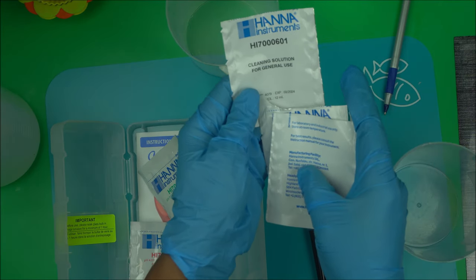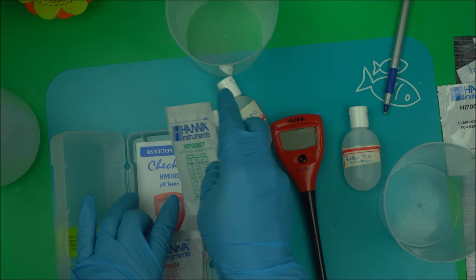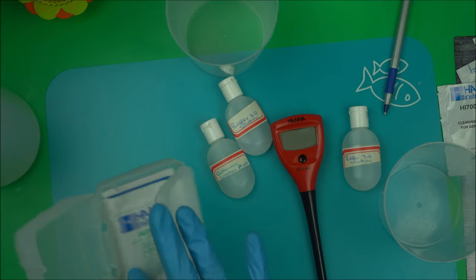You also get the general cleaning solution. So these are the three solutions that come with it. Now the first thing I'm going to show you is how to use your pH meter.